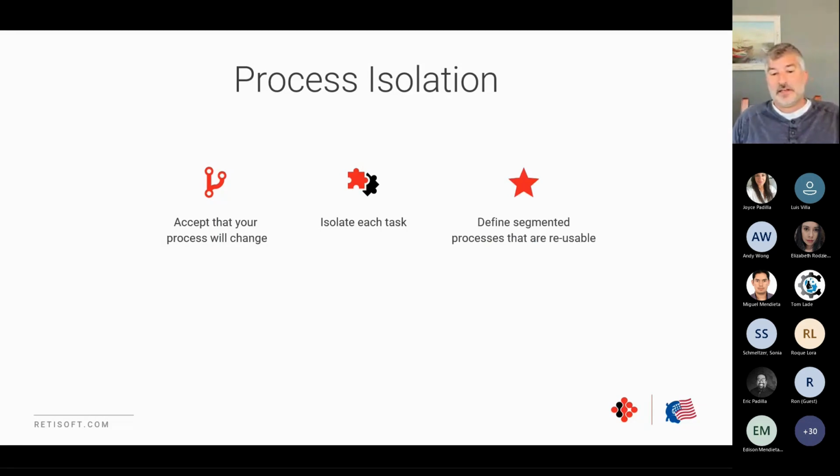And so then there are many things done in a lab that are a series of 2, 3, 5, whatever individual of these little tasks that we've broken things down to. And these are small processes that are often done in many larger workflows. And it's easier to find them as their own sub-process and then use that sub-process over and over in the larger flows.